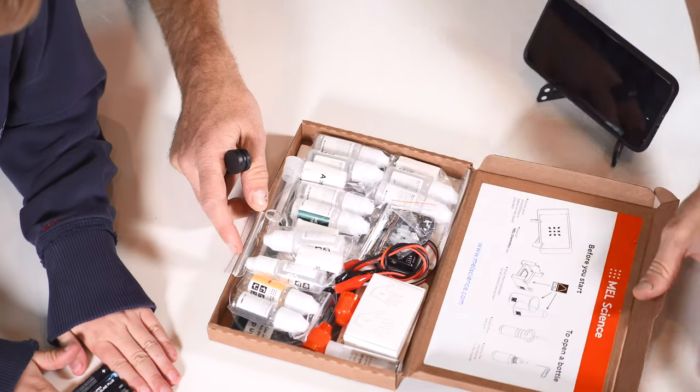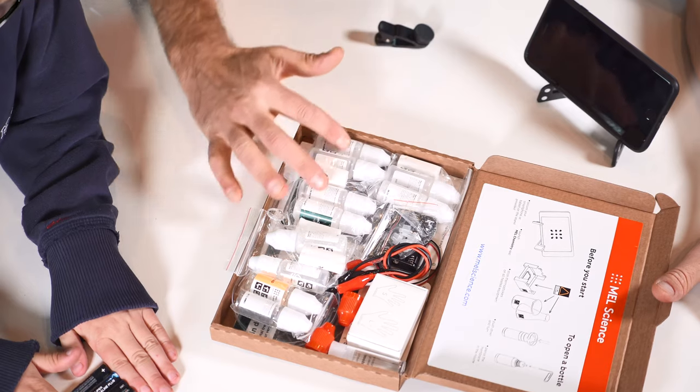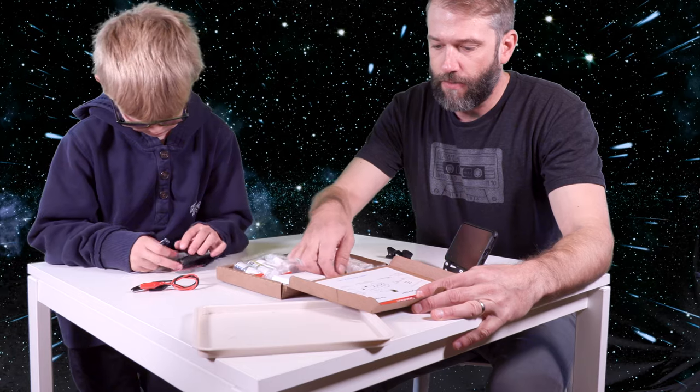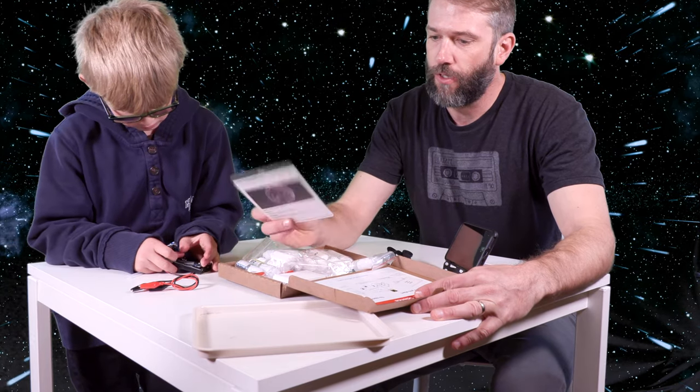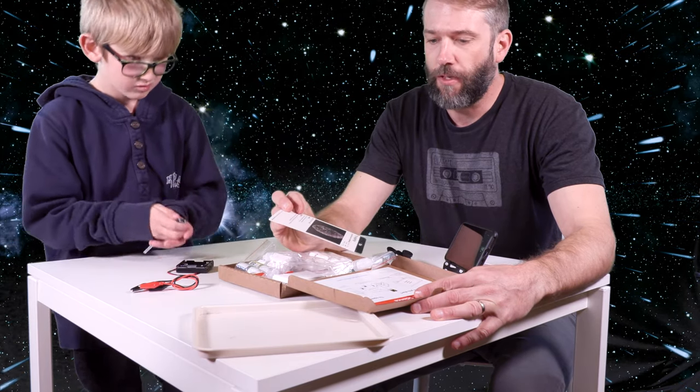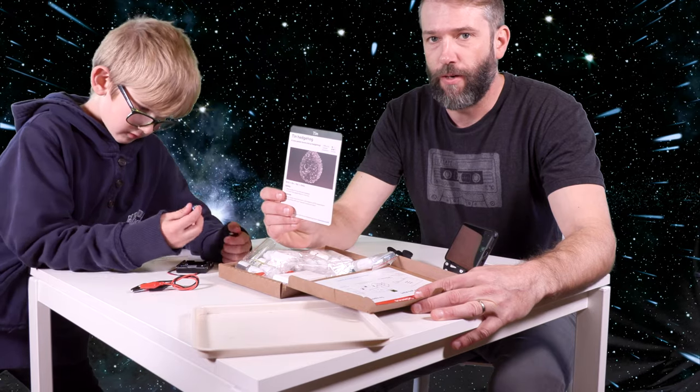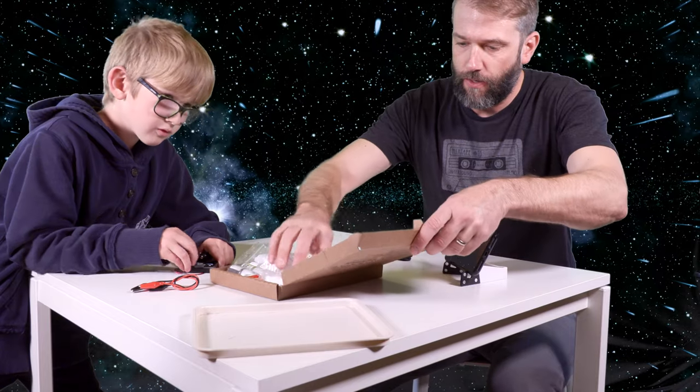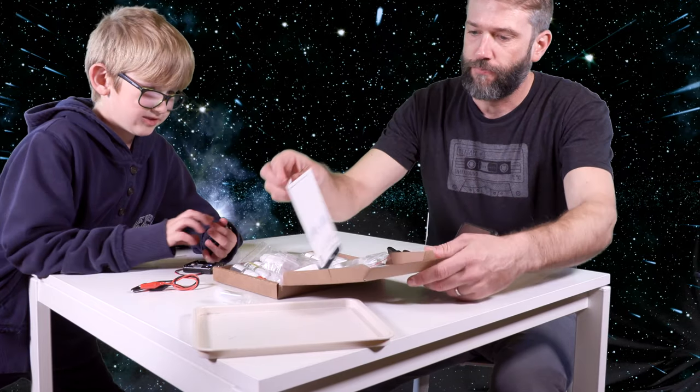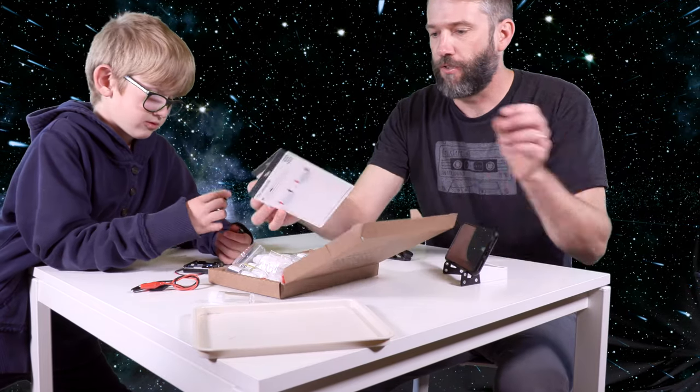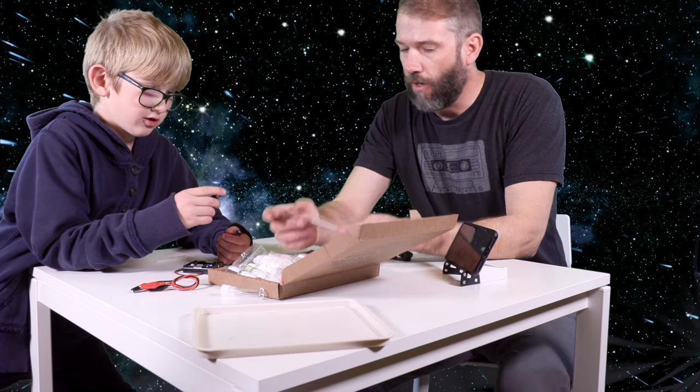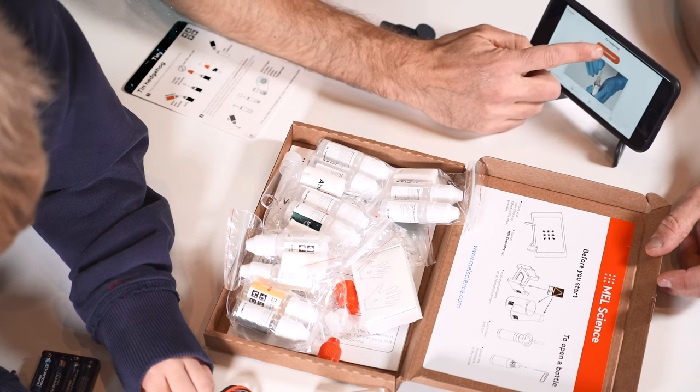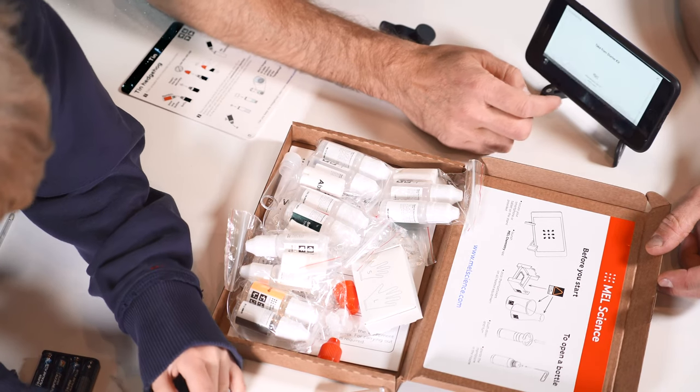There's a macro and a wide angle. I believe the wide angle is on it right now. I believe this is the macro. So this is the macro and this is the wide angle. So it comes with instructions and a whole lot of chemicals. Inside the kit are these two cards, informational cards, one for each experiment. This is the tin hedgehog, which we'll do next. We'll start with the dendrite. Do you want to do the hedgehog or the dendrite? Hedgehog. So we'll do the hedgehog first.